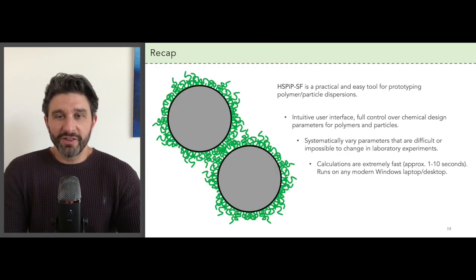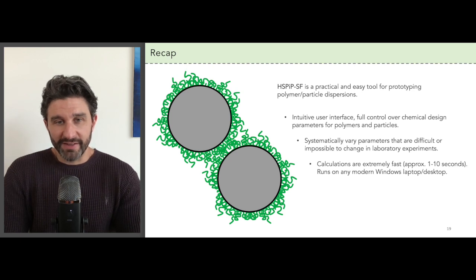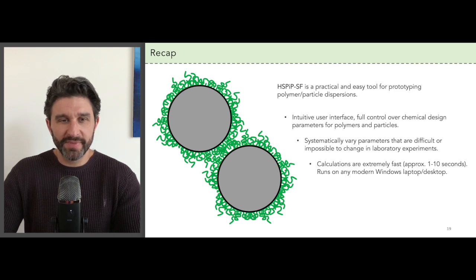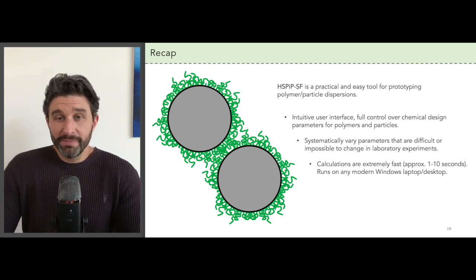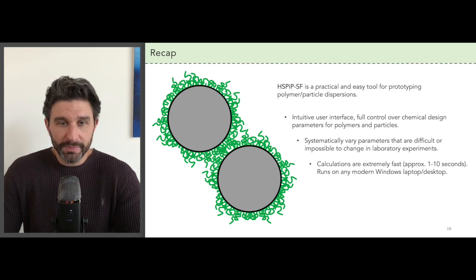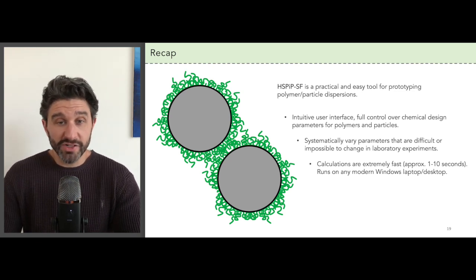All right, so that concludes this brief walkthrough of HSP-IP SF, a very easy and practical tool for prototyping polymer particle dispersions. It's an intuitive simple interface and you have full control over the chemical design parameters for the polymers and the particles as well as the interactions between those entities.